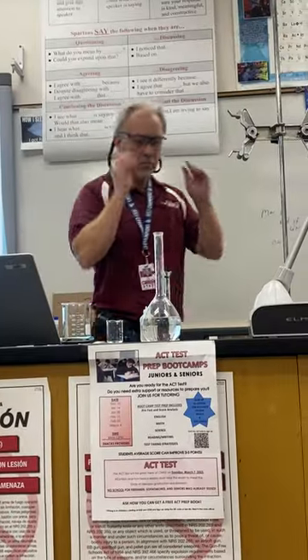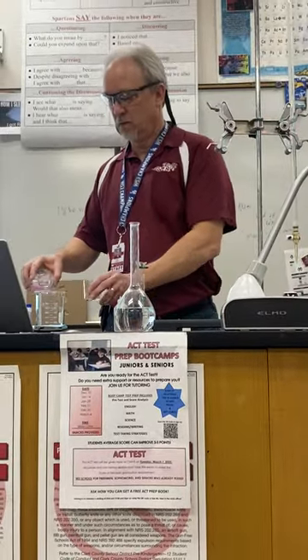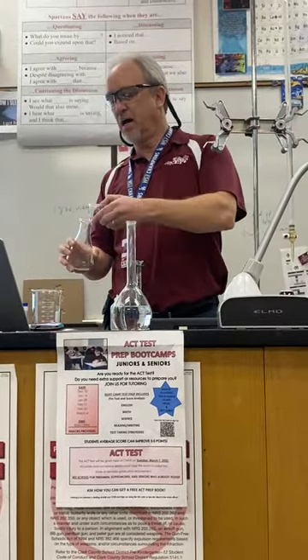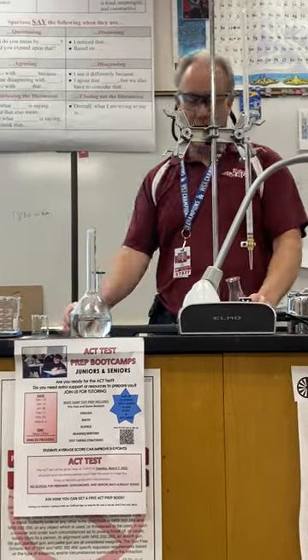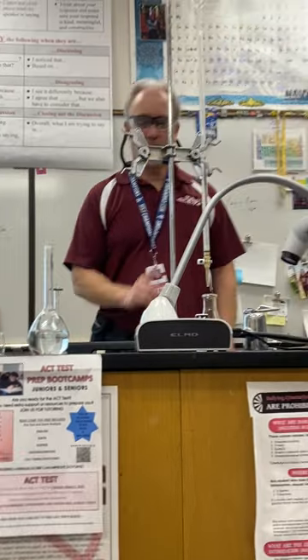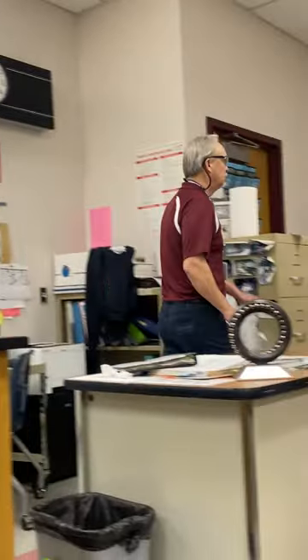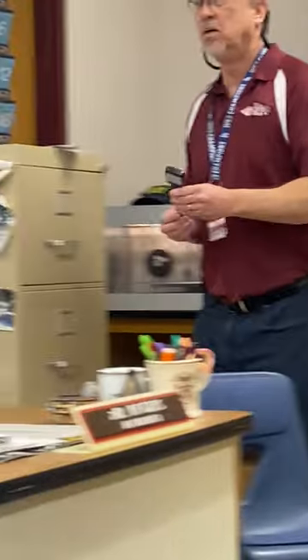Then I do it again. Dump everything in the waste beaker. Clean everything out. Add my unknown again, measure it out, put some water in there. Put some indicator in there. One of your three trials, you're gonna use a pH probe. I only have a couple at work. That kind of sucks.